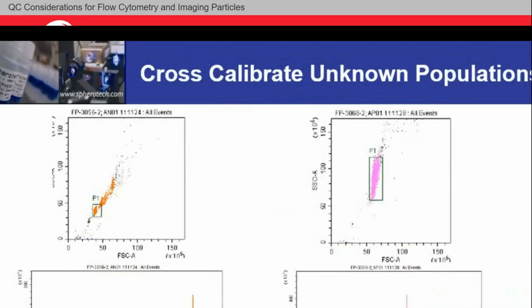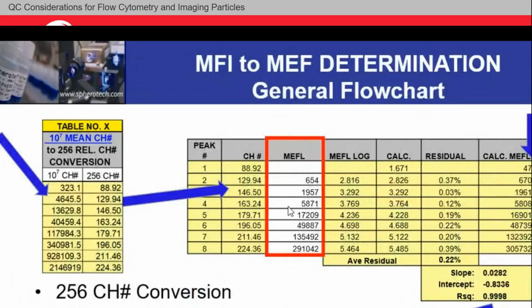And this one down here, that's more similar to population 4, right? If I'm looking at population 4, I'm getting about 5,000, about 2,000. I'm on the same order of magnitude. Maybe that's more like population 3, between 3 and 4.